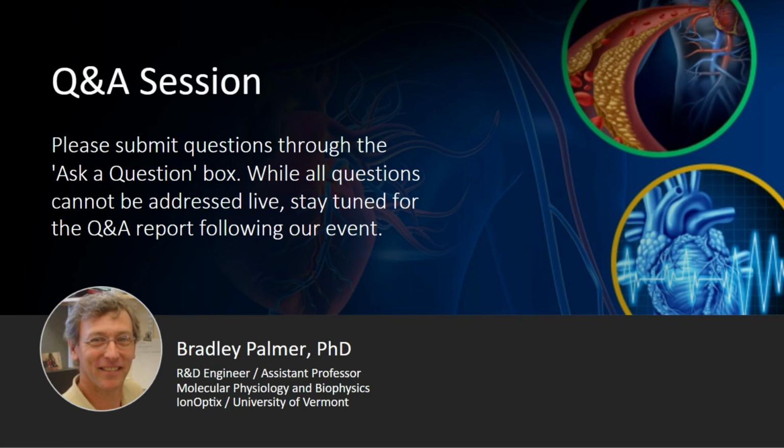That's a great question, because the mouse heart is about 1/10 of the size of a rat heart. But we have found we can use mouse hearts quite well. It's just that you get fewer slices. But I would not recommend using a mouse younger than 12 weeks. That would just be my recommendation. You can certainly give it a try, but you want the mouse to be as close to adult age as possible.